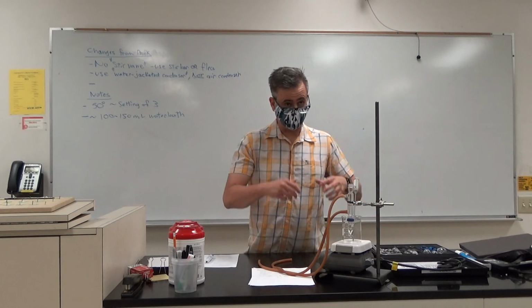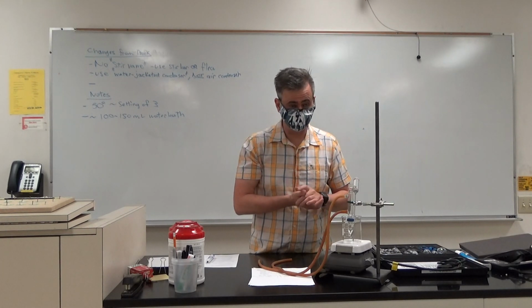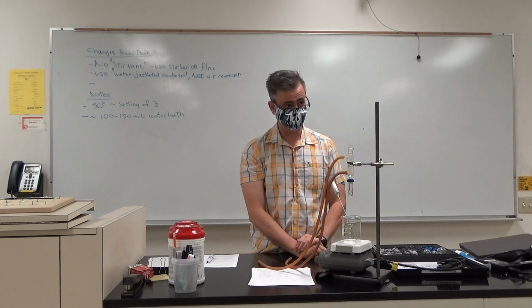Okay. After the 10 minutes of heating the reaction, okay, and stirring the reaction, you need it to cool. Just lift this guy up, and he can cool like that. Okay.